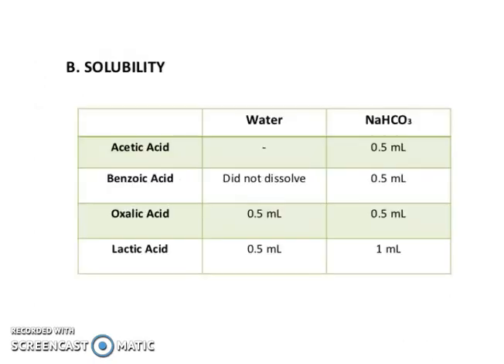Now solubility. You can see here acetic acid in water and with sodium bicarbonate 0.5 ml. You can see the benzoic acid did not dissolve, and oxalic acid 0.5 milliliter and lactic acid 0.5 milliliter.